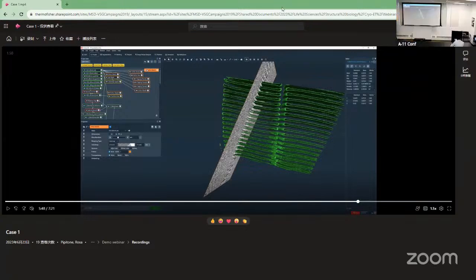Questions? I do have one question. It may be better directed to Mark, just because I know he's worked on auditory hair cells before. But I wanted to know if there was any part of the program that's detecting filaments that could actually detect branched filaments or determine the angle between filaments. Because in our system, we know not all the filaments are exactly parallel or separate. We actually have a lot of them that branch, and we're interested in finding a way to quantify the angle of that branching.